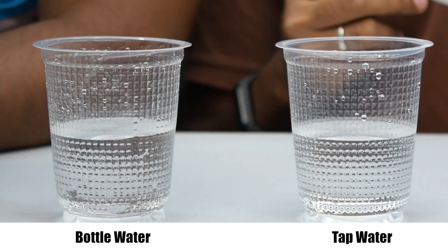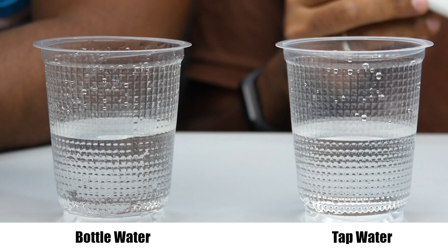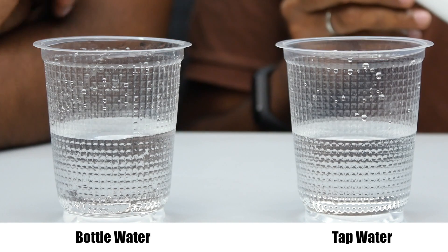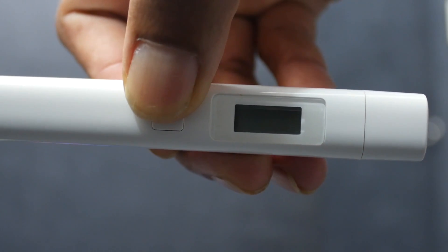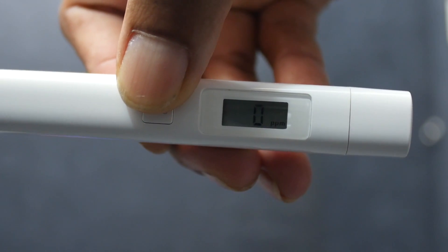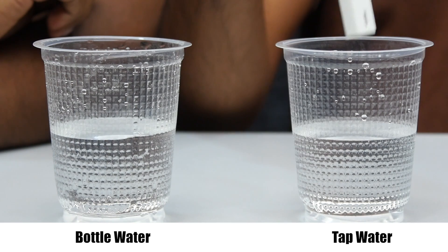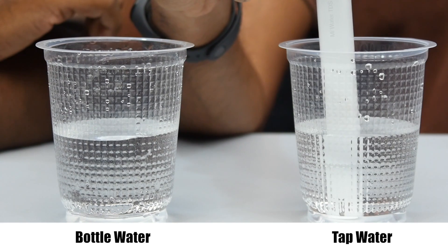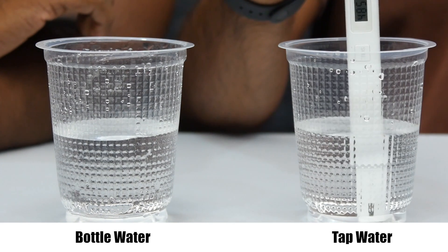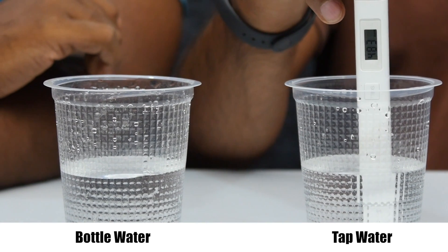Now we have two water samples: one is Bisleri bottled water and one is tap water. We can see the value in PPM — we can set the TDS meter to zero PPM. Testing tap water first — the reading shows 485 PPM.